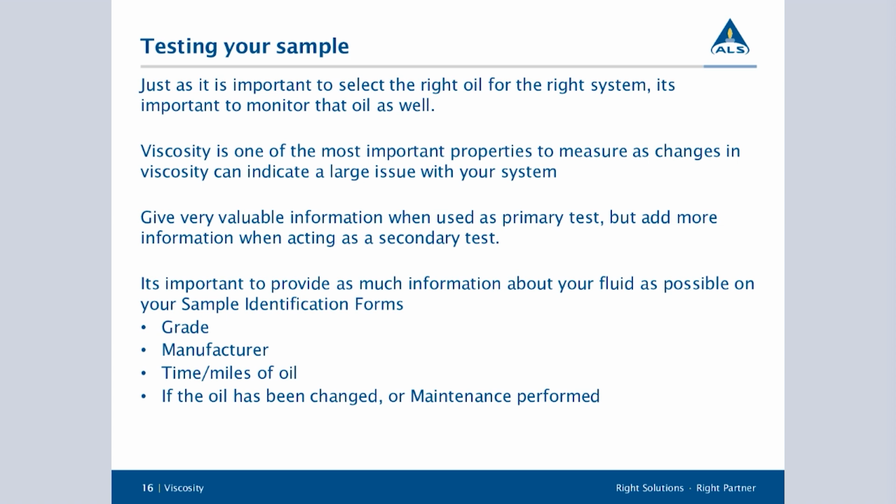Those are huge things that I always like to push, as well as any maintenance performed. This one's key. I actually asked one of our diagnosticians if they thought anything else should be included, and that's what maintenance you're performing. Because if you've performed maintenance on your equipment, and they know what you've done, they can say what you did was good, what you did helped, or, you know what, I am seeing an issue with this, and I see that you did this maintenance. Do you want to double check and make sure that air's not getting in because there might not be a proper seal, or something along those lines?